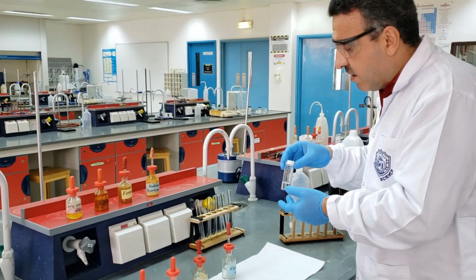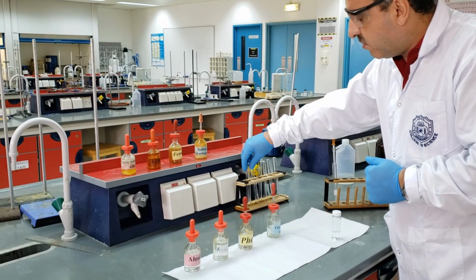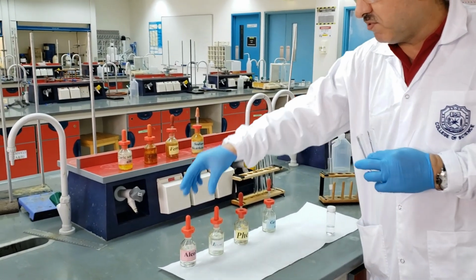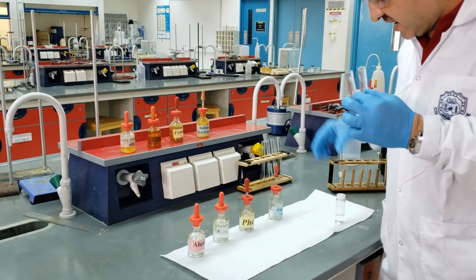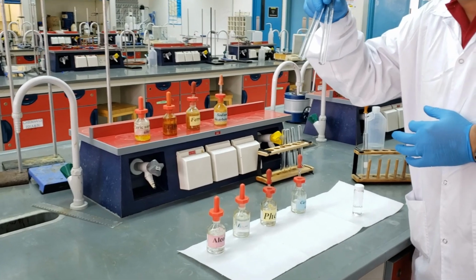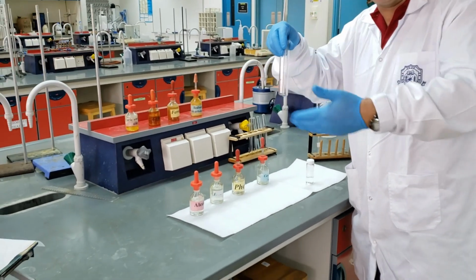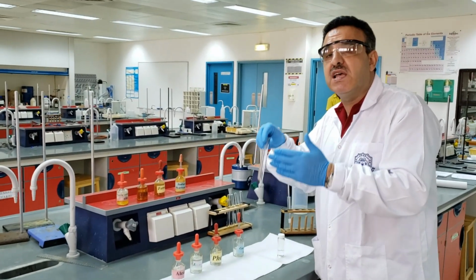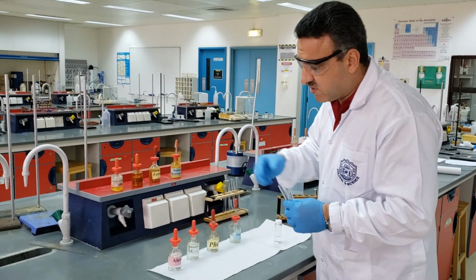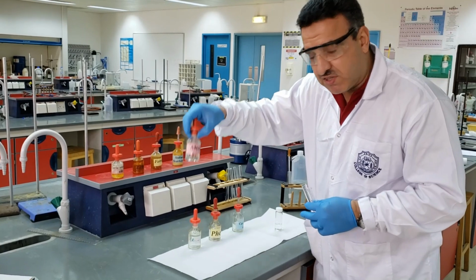What we are going to do is the chemical test twice. We are going to do the chemical test for a known compound as well as for the unknown compound. If the results of the chemical test match, which means they give the same change in physical properties, that means they contain the same functional group. So let's start now. The first question: does my unknown compound contain alcohol functionality?